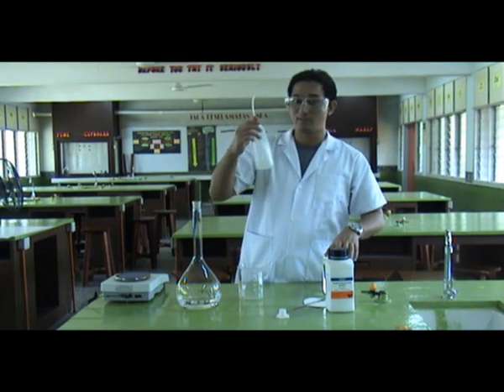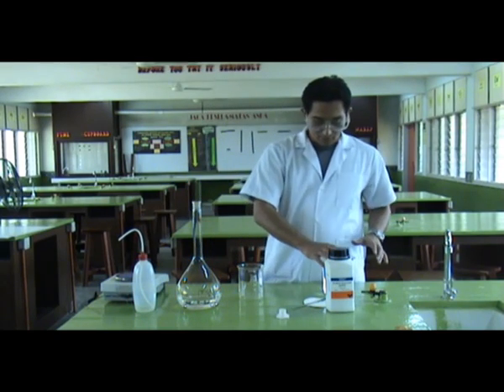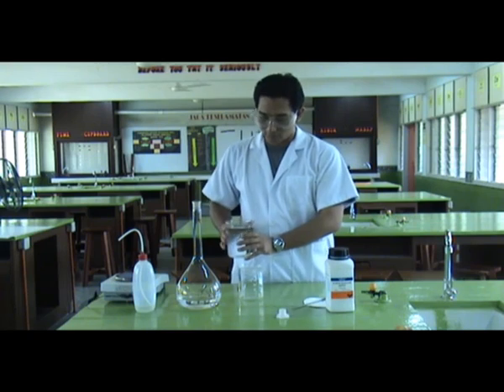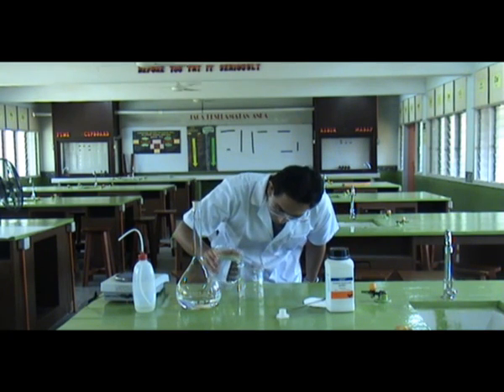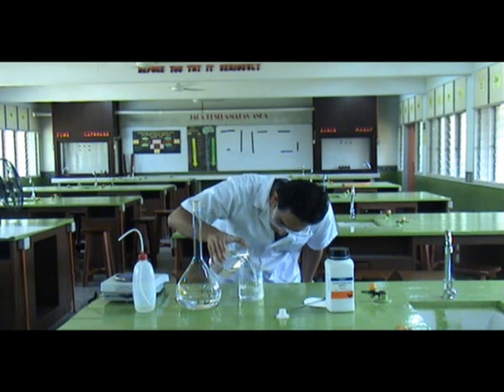My distilled water in the wash bottle is already finished, so I will use fresh distilled water and add more 500 ml of distilled water. Slowly add it through the beaker until we reach the 500 ml mark.